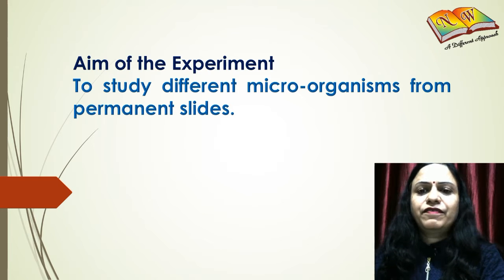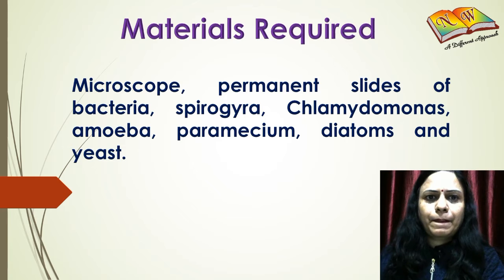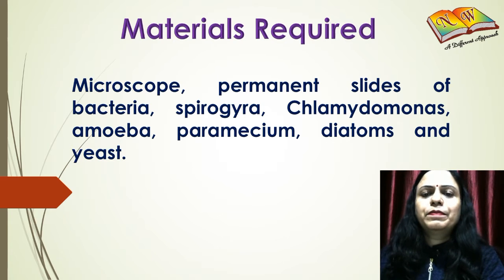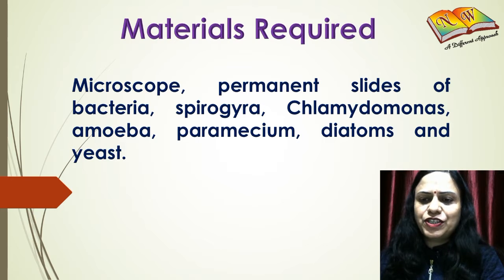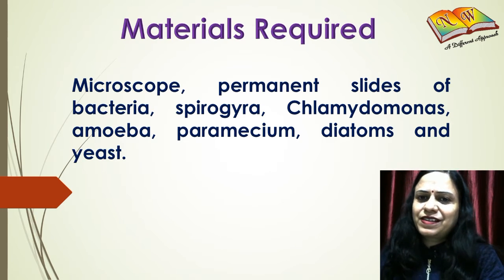In this experiment, we are going to study different microorganisms with the help of permanent slides. The material required is a microscope, permanent slides of bacteria, Spirogyra, Chlamydomonas, amoeba, Paramoecium, yeast, and whatever other microorganisms you can get.